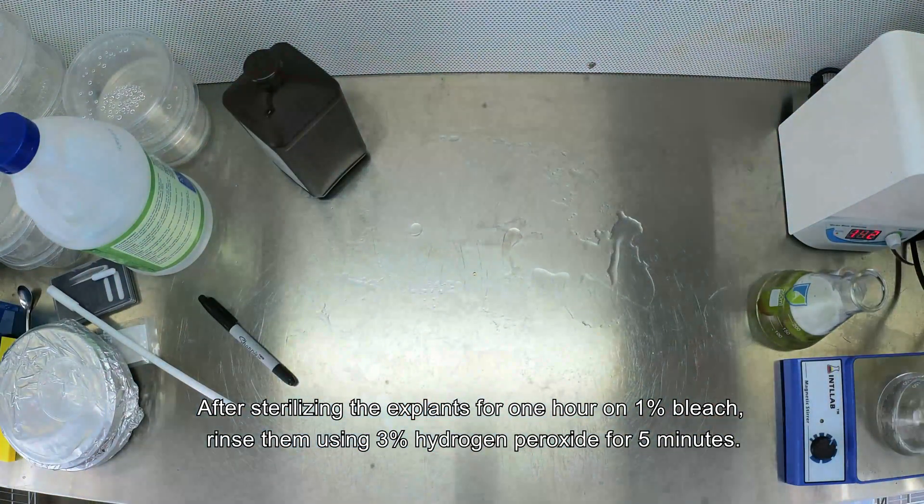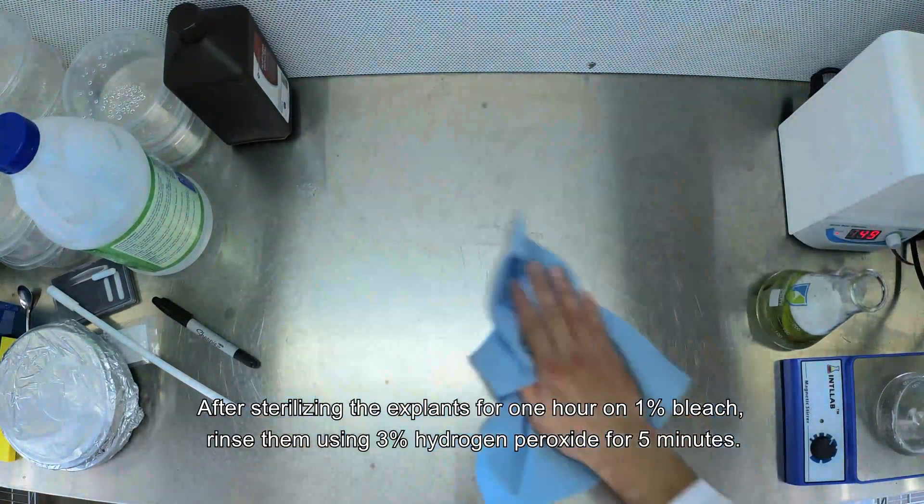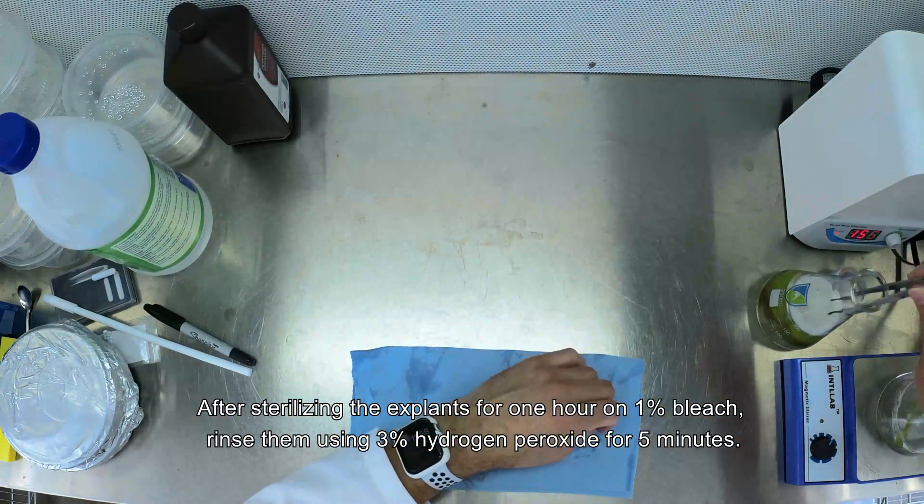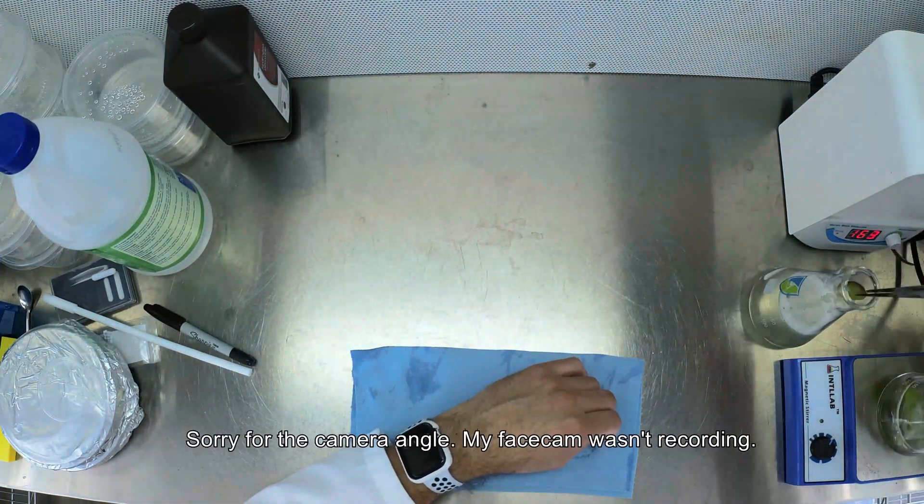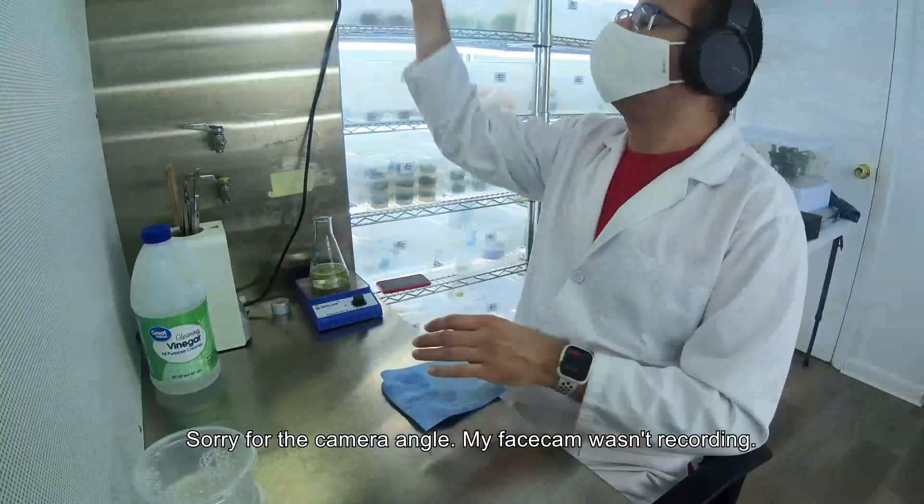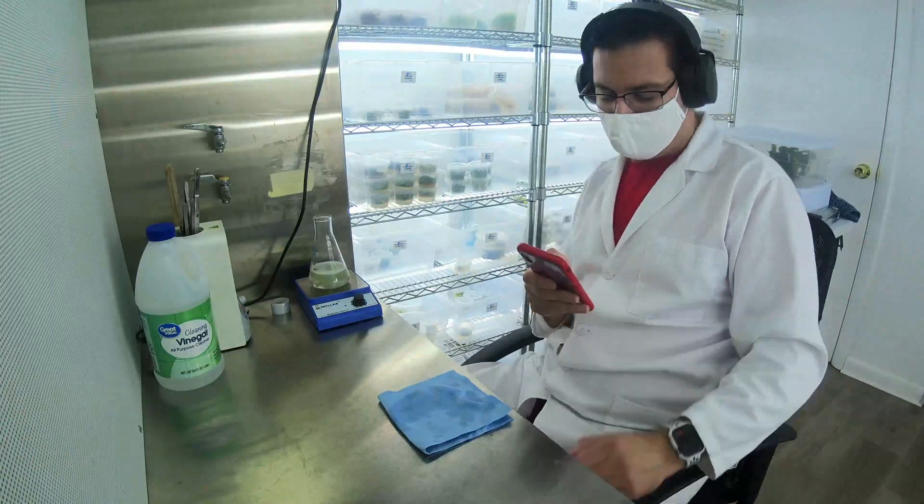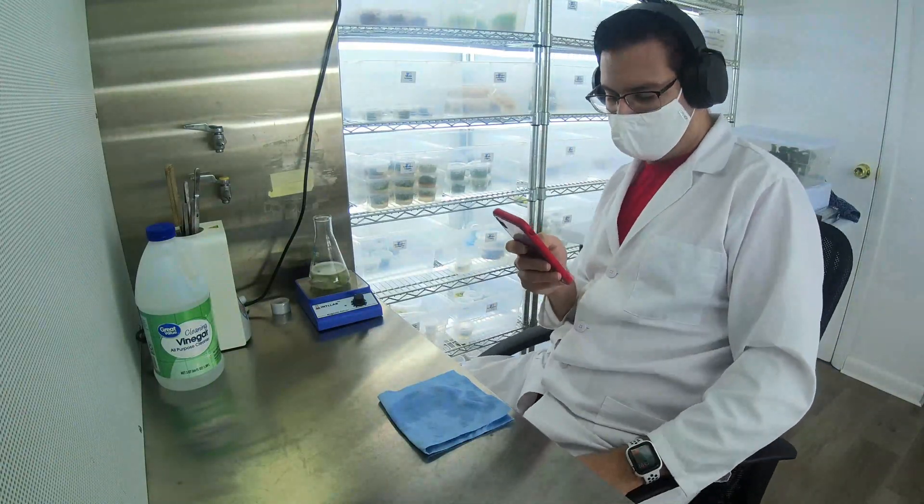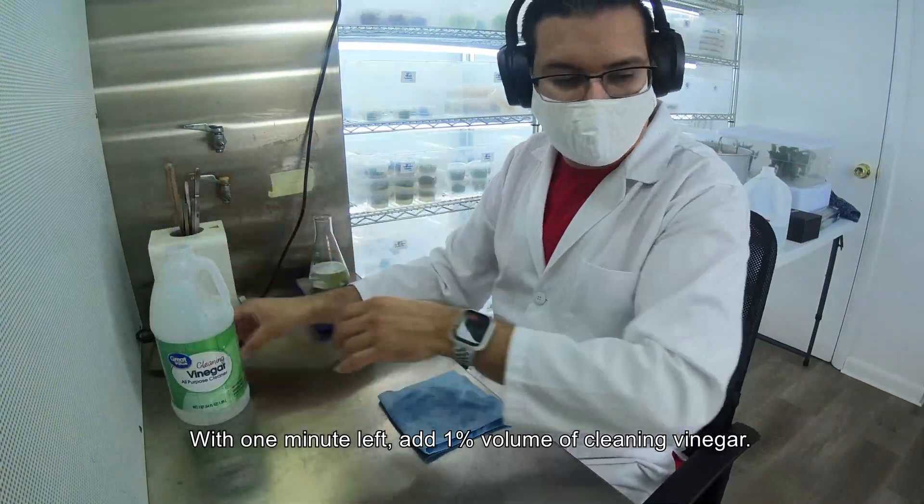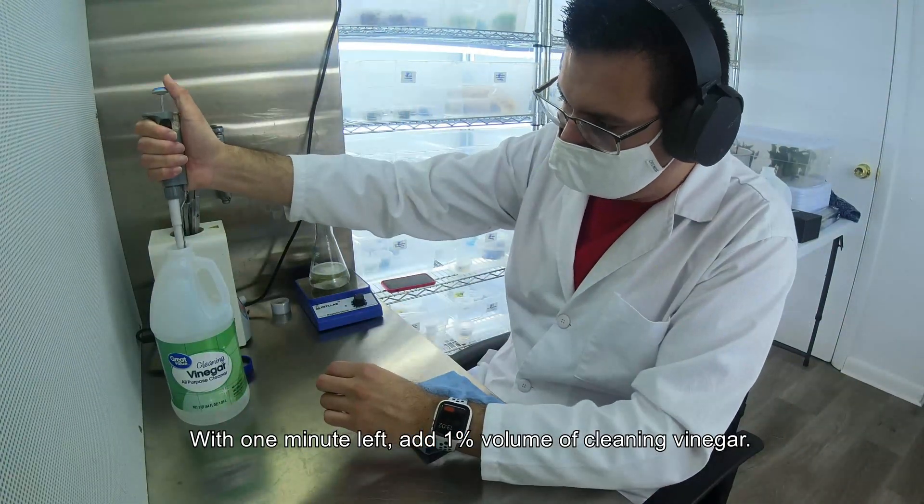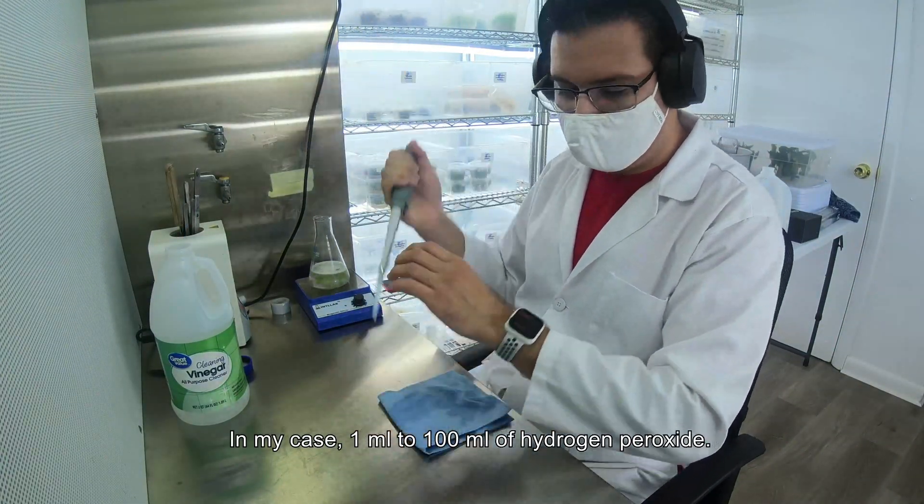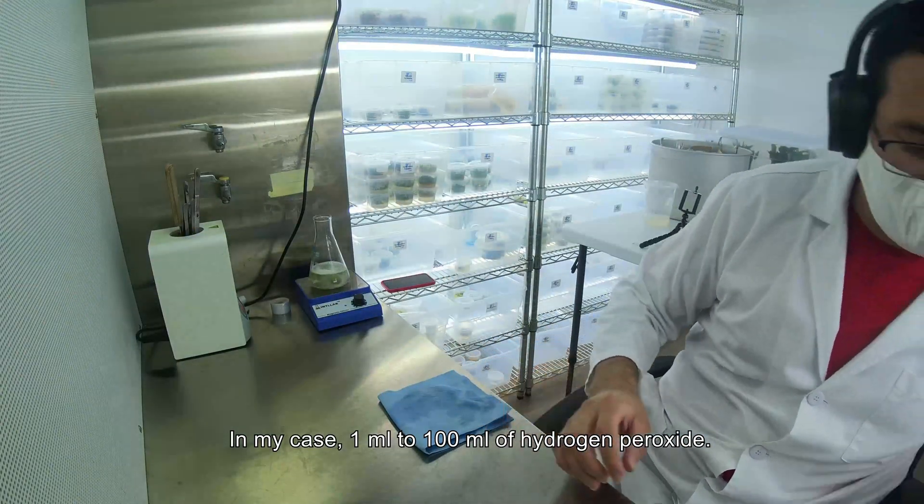After sterilizing the explant for one hour in 1% bleach, rinse using 3% hydrogen peroxide for five minutes. Sorry for the camera angle, my face cam wasn't recording. With one minute left, add 1% volume of cleaning vinegar. In my case, 1 ml to 100 ml of hydrogen peroxide.